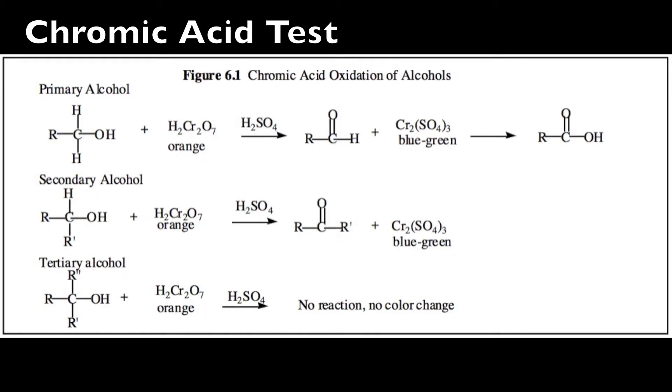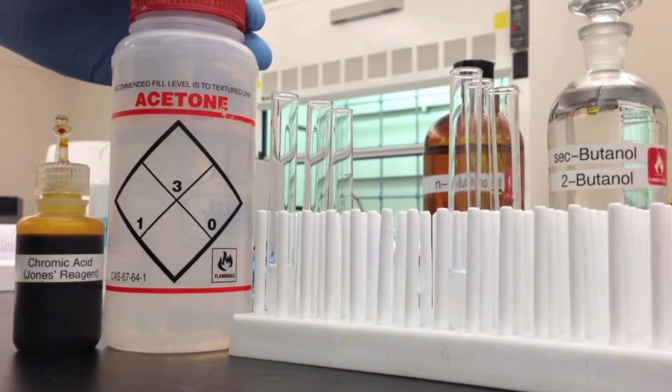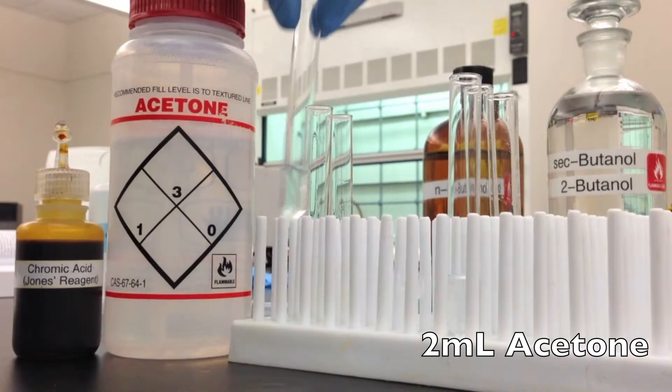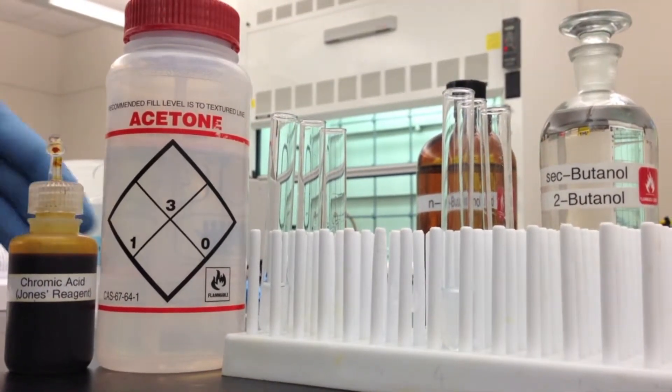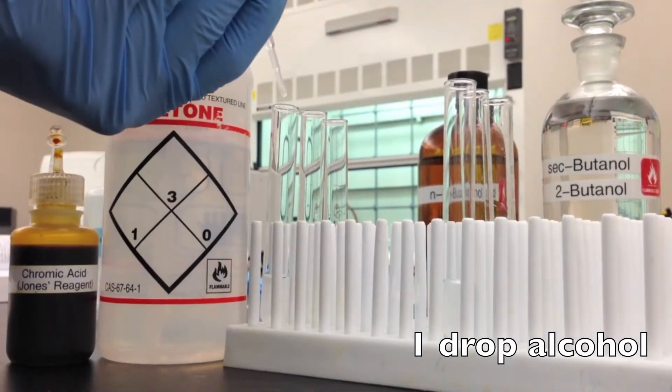Okay, so this is our third test, the chromic acid test. Now to begin, you want to add roughly two milliliters of acetone to each of the test tubes. And then you want to dissolve one drop of each reagent.